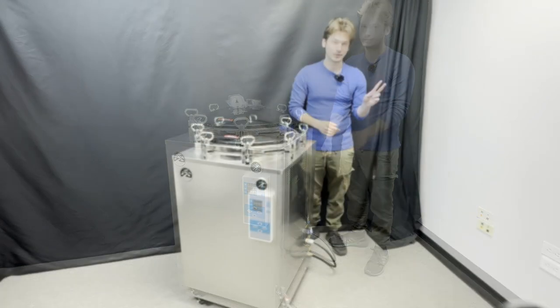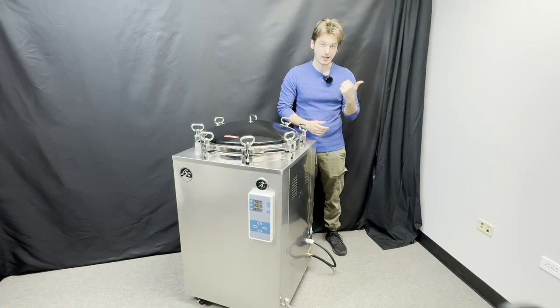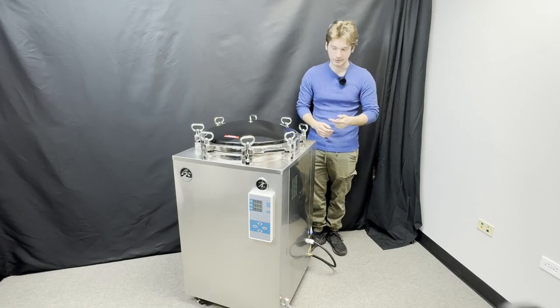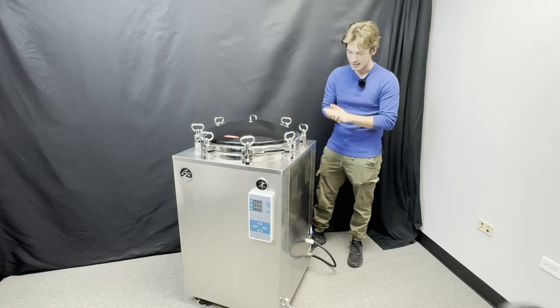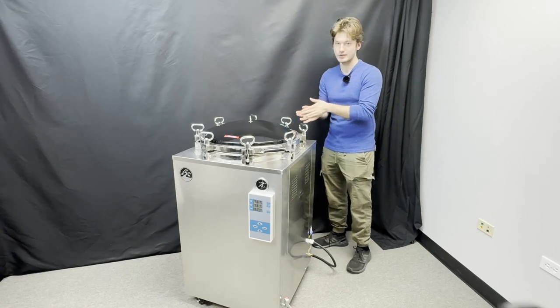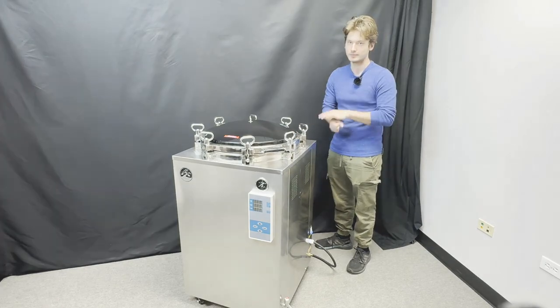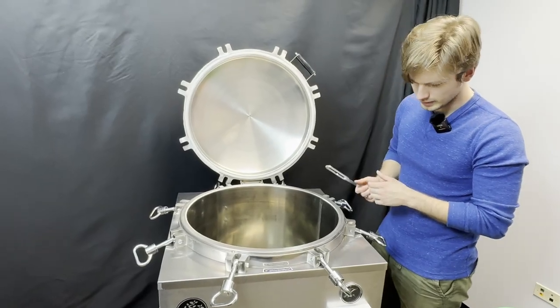This system comes with two depressurization modes: natural depressurization, as well as a computerized auto-venting depressurization that takes place over 20 to 30 minutes. If you're a growing mushroom business looking to increase your efficiency as well as your work output, then this is the system you need.